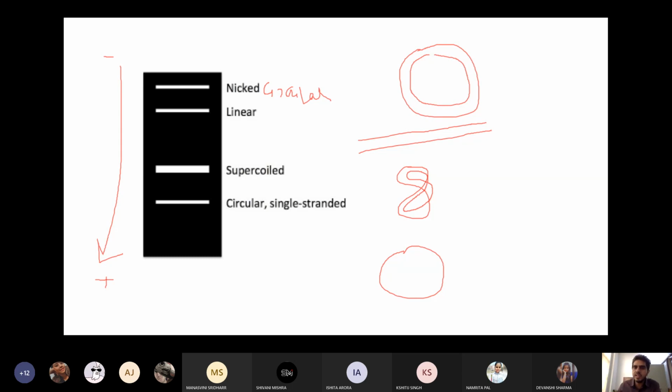So here one thing is common, size is common. Size wise, all are alike. So size is not any issue in this case. If you say it is 1 kb, all are of 1 kb, but all of them, 1 kb, are migrating differently. A little bit of what Manaswini said is right also. We are going to utilize it. That's what you mentioned. So next I'm going to call.